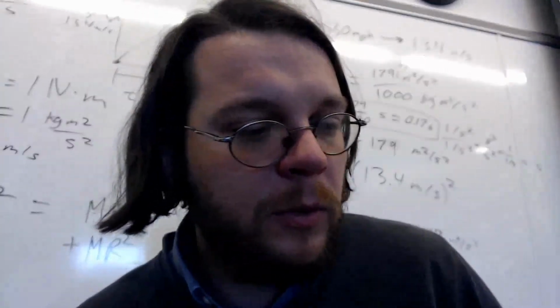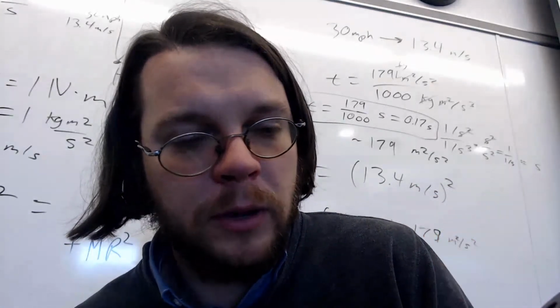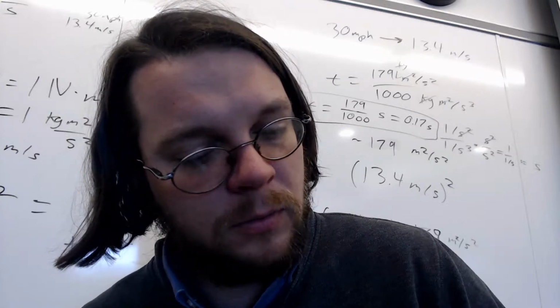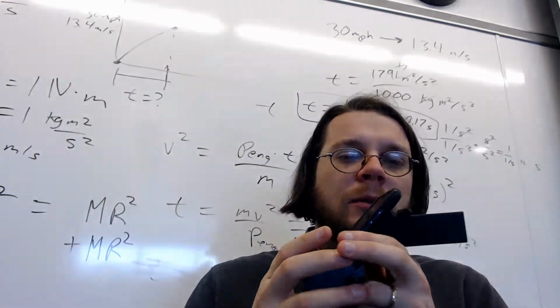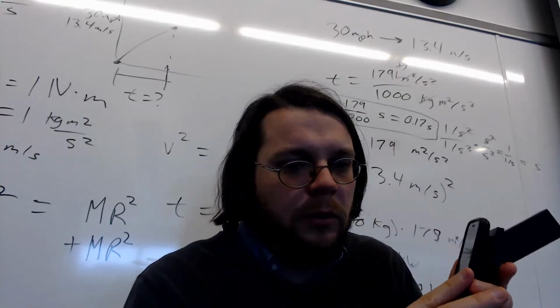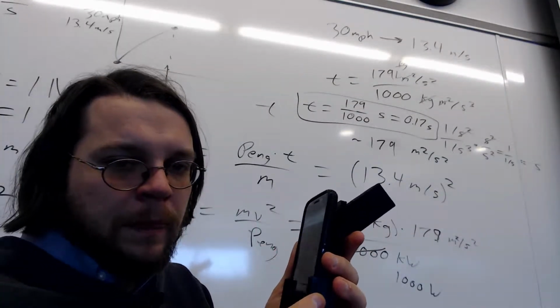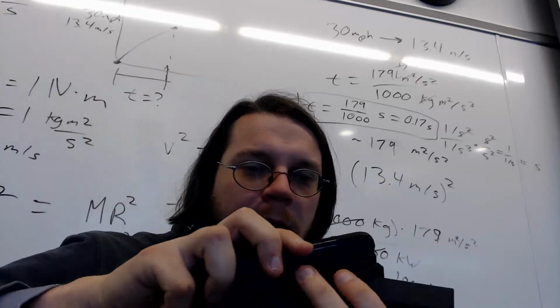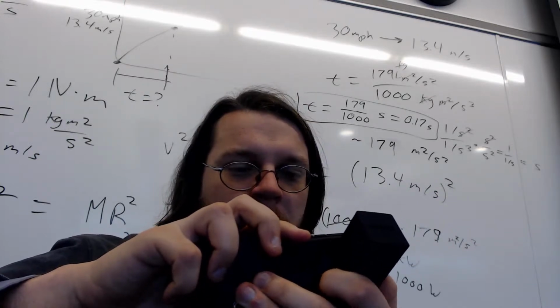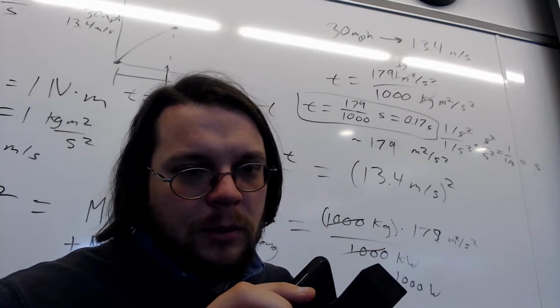Now, there's a couple different ways, in principle, that we could use this thing. So the way I'm going to do it is, obviously you put your phone through the grip here and do it like this, so that you're using the phone and the setup like this when you're taking a spectrum. In principle, you could do it like this, but with this thing rotated, if that makes any sense. But I would not recommend that. That doesn't seem to work very well.